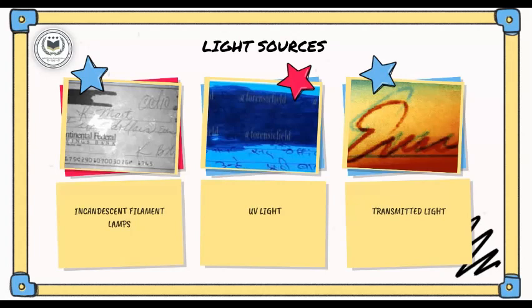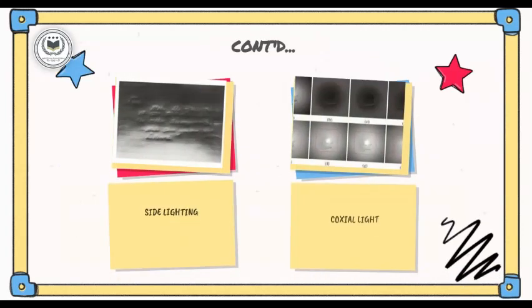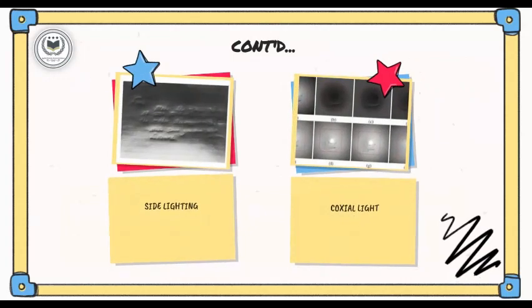The VSC offers three different kinds of transmitted light. These light sources are located underneath the trans-light panel. The side lighting is also a broadband illumination. There are two lamps, one on the left-hand side and one on the right-hand side of the text platen. These can be used individually or they can both be on at the same time.